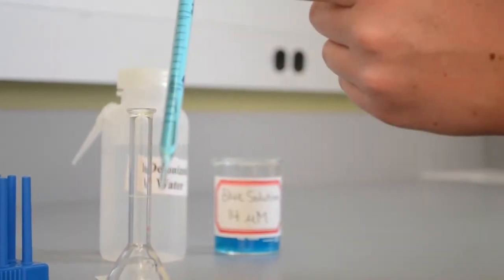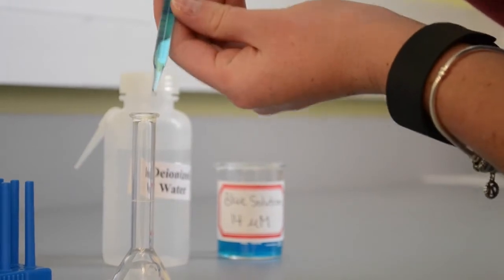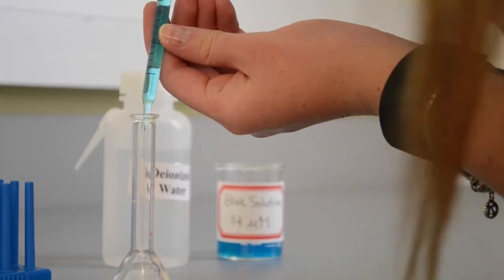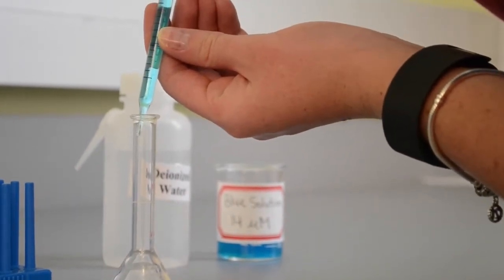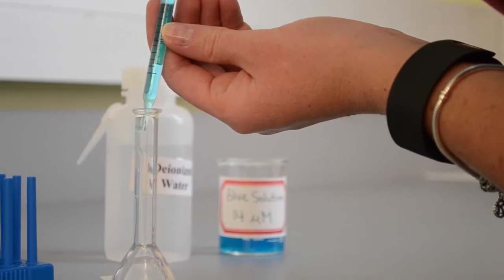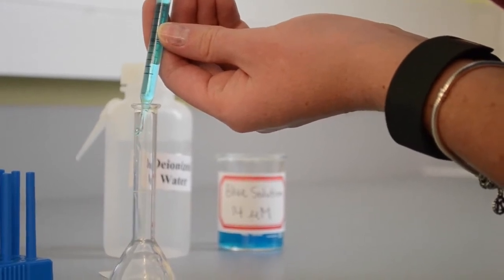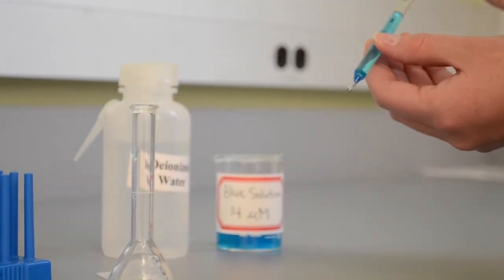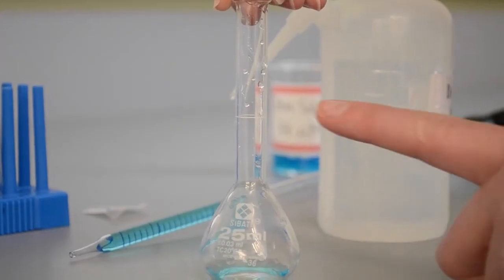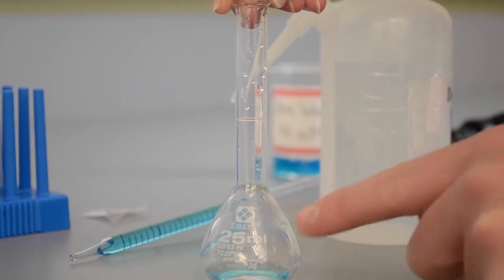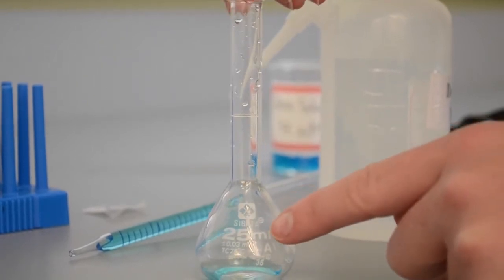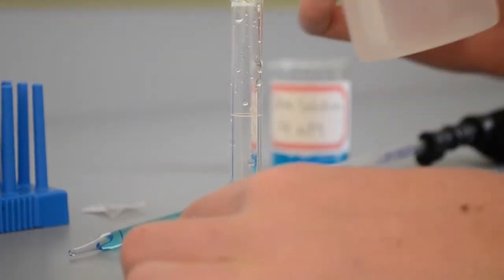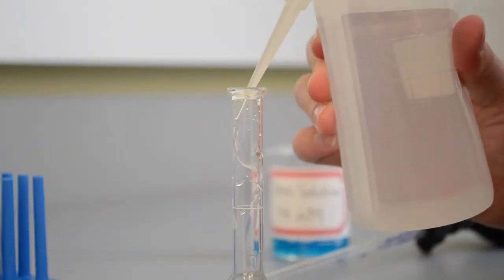One milliliter of the blue solution is added to the volumetric flask. The line on the volumetric flask represents 25 ml. Water is added in order to make the dilution.